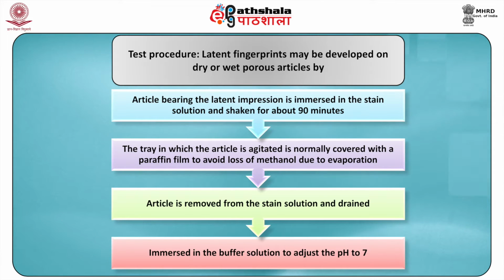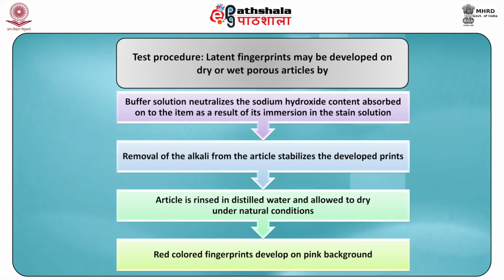It is immersed in the buffer solution to adjust the pH to 7. The buffer solution neutralizes the sodium hydroxide content absorbed onto the item as a result of its immersion in the stain solution. Removal of the alkali from the article stabilizes the developed prints. The article is rinsed in distilled water and allowed to dry under natural conditions. Red colored fingerprints develop on pink background.